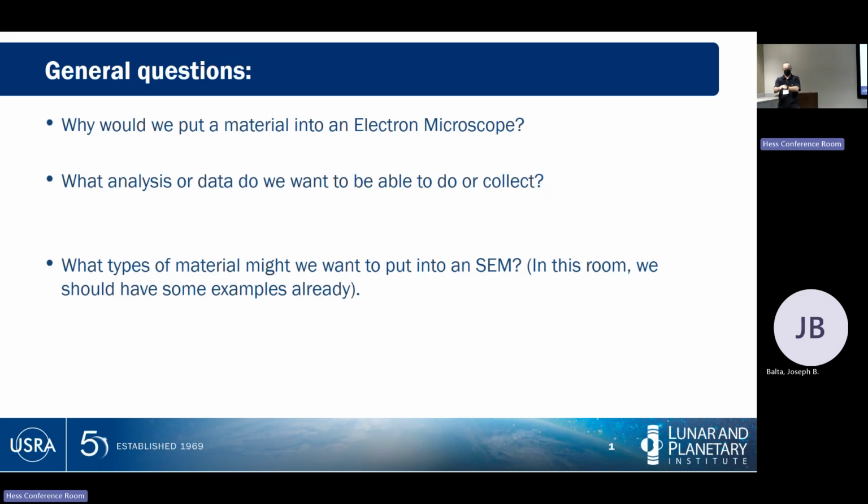If you want to catch a time-lapse video of something, that could be specific software to capture time-lapse videos. That could be a specific SEM design where we want to limit contamination, so we make sure there's a cold trap in there.